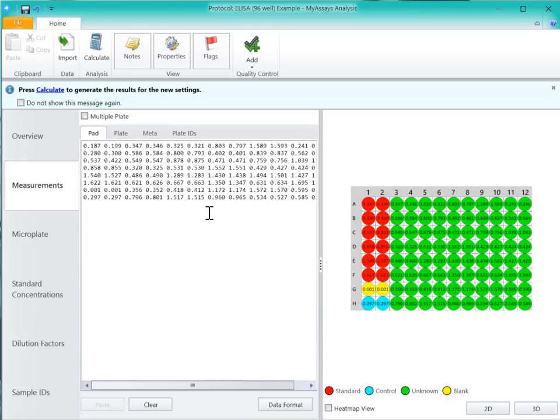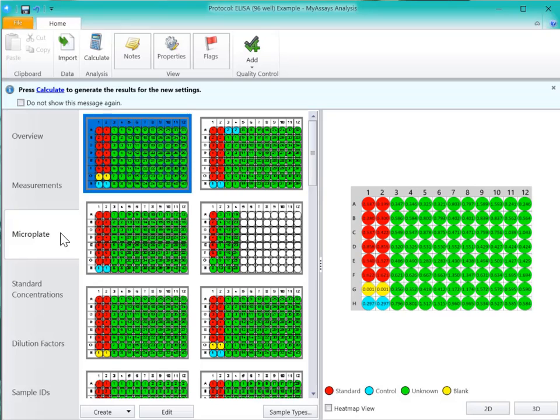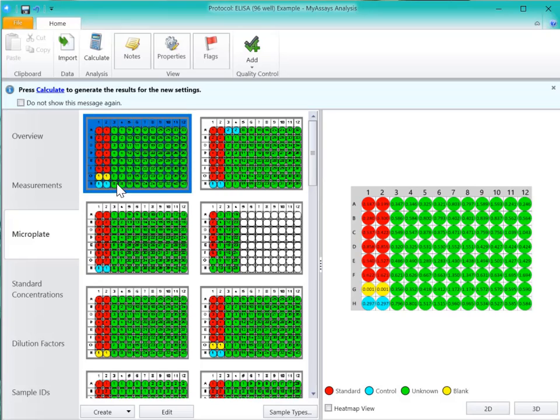After we've imported our measurements, you can see the changes to the Measurements tab, and we can select the Microplate tab to change the layout if needed. This layout matches my assay layout, so I'll leave it as is.